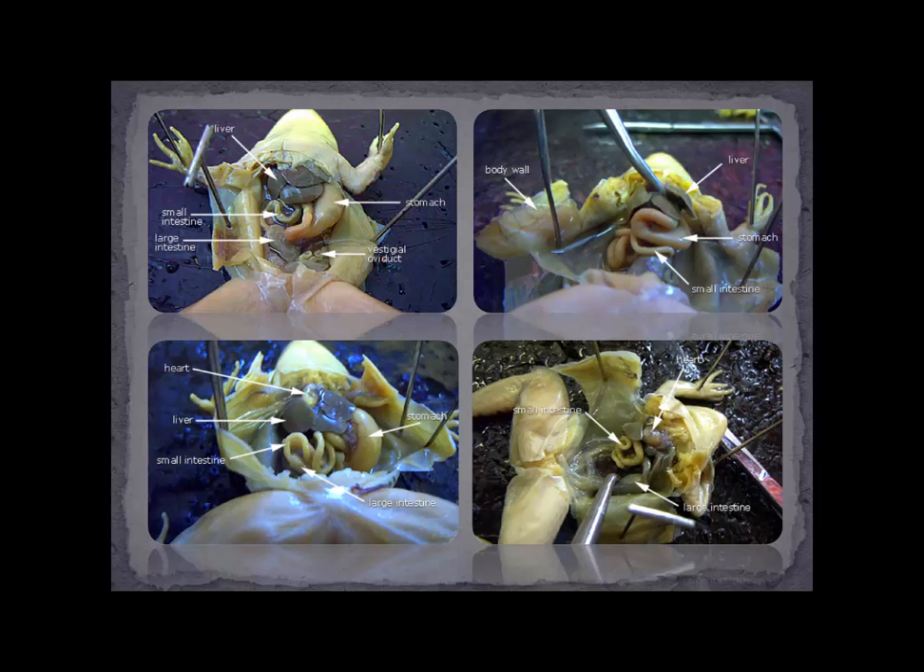We've got something called the vestigial oviduct. In females, the oviduct carries the egg from the ovary into the body cavity and then carries those eggs out the cloaca or urogenital opening. They are present in males but not functional. You can think of vestigial structures — there are others in humans, like the appendix, which doesn't have a definite function. Females have mammary glands that are functional and produce milk, but males also have nipples that aren't functioning — they're vestigial. Just because an oviduct is present doesn't mean it's a female; it could be a male, so we'd have to examine further.